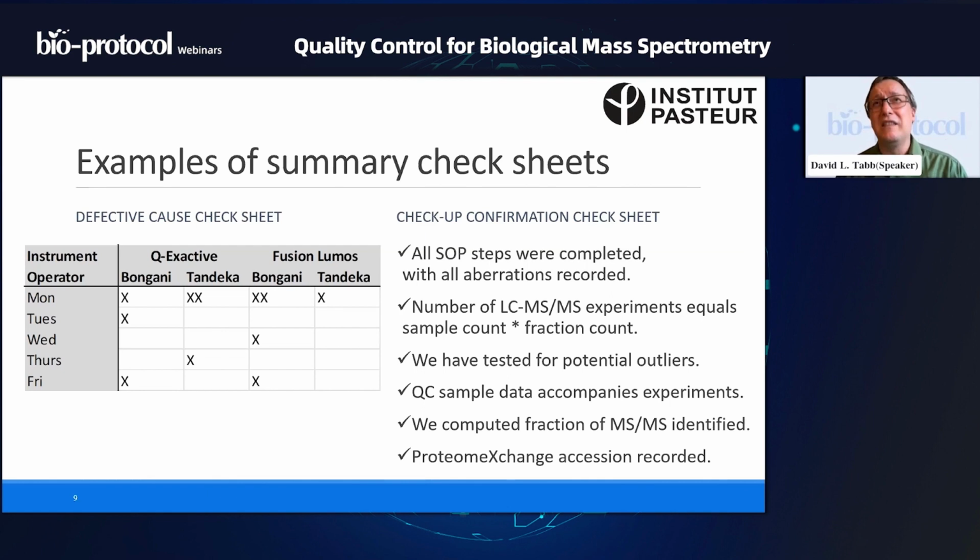Now, it could be that the operators come in on Monday and the operators are more prone to making mistakes on Monday. I know I am more prone to making mistakes on Monday. Or it could be that something is happening on the weekend with our instrument. What if the instrument lying fallow for the weekend causes it to be more likely to fail for us on Monday? Either of those two possibilities could be an interpretation. We would like to know which.